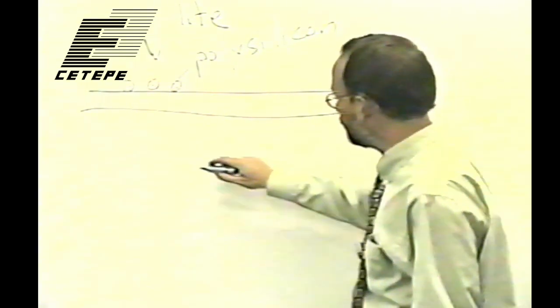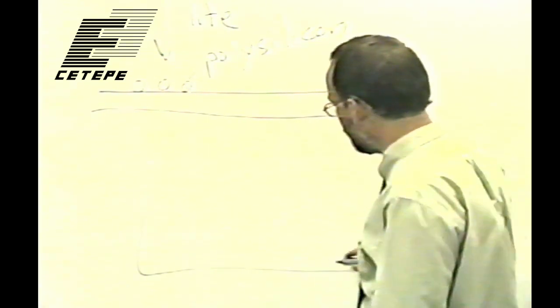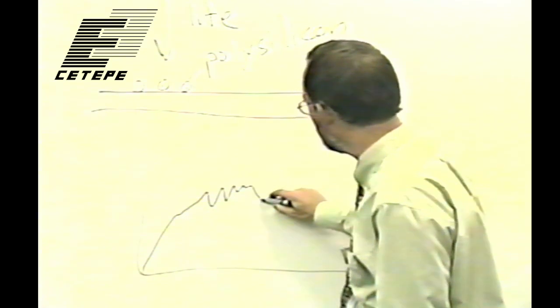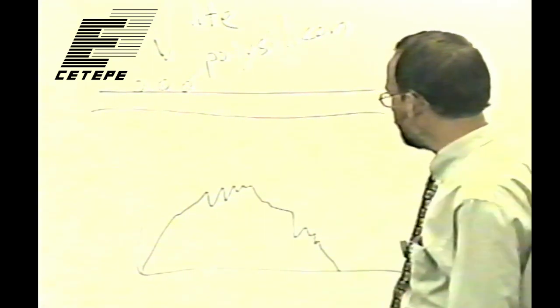And so if you plot the quantum efficiency of these things, it's not only low, where this would be about 40%. This is detective quantum efficiency. It's not only low, but it has this kind of structure in it because these gates are differentially transparent as a function of wavelength.